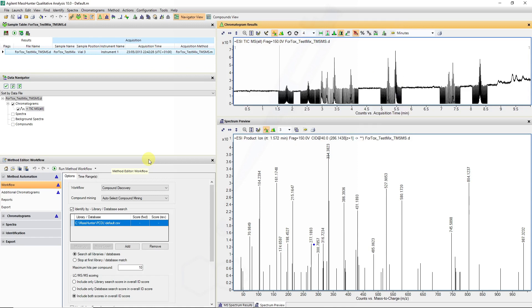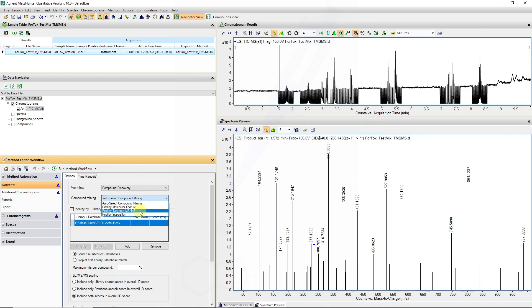So now we can run through our compound discovery workflow and find by targeted MS-MS using the library to assist in identification of some of these features. I'm going to go back to compounds view.